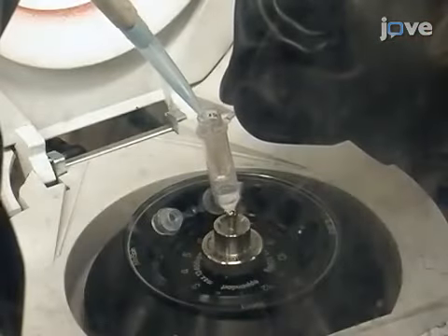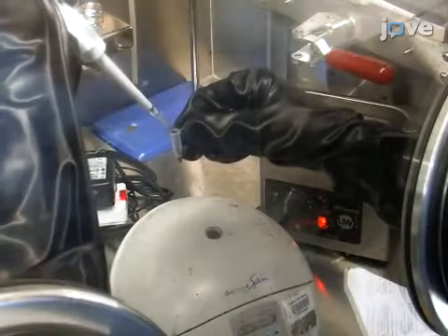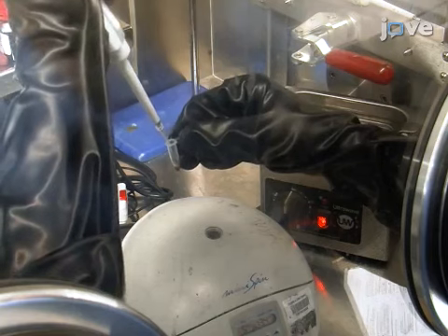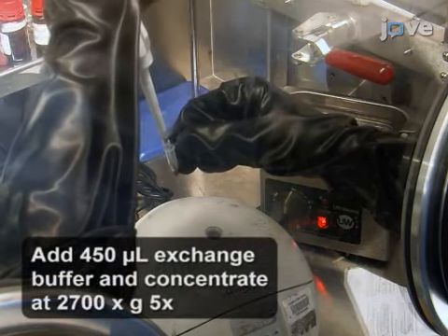Reconcentrate the mixture 4 more times to complete the buffer exchange. Then, combine 5 µL of the 20 mg per mL carbon black dispersion with the buffer-exchanged hydrogenase.